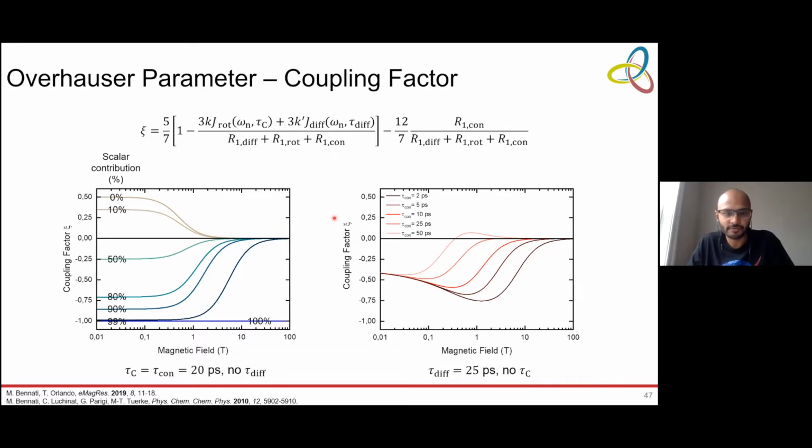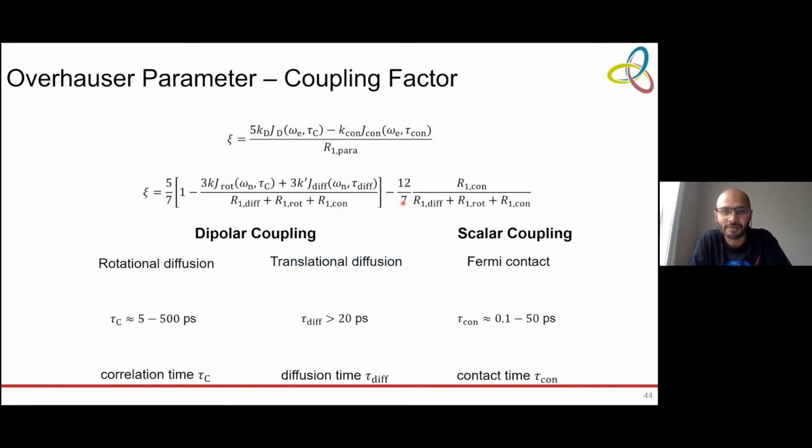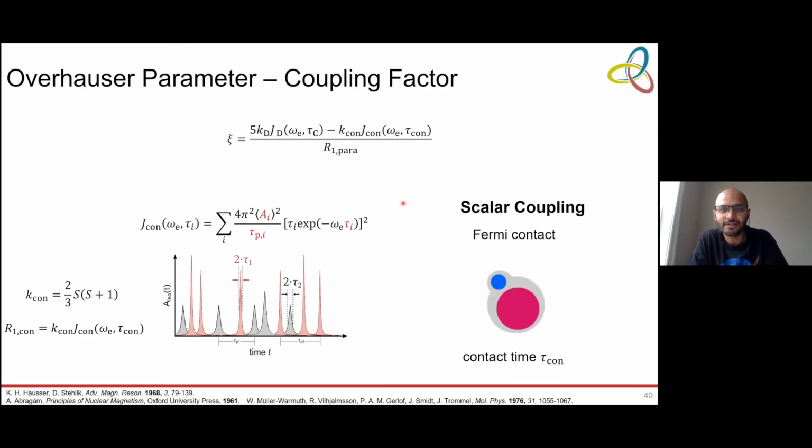So far, it seems you don't have any question, but I have one question here. What determines this time constant for the Fermi contact interaction? And you talked about a pulse there. I didn't really understand, what do you mean by pulse? Is it the contact period?